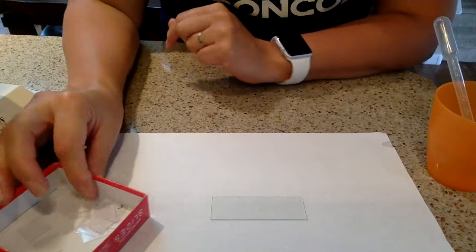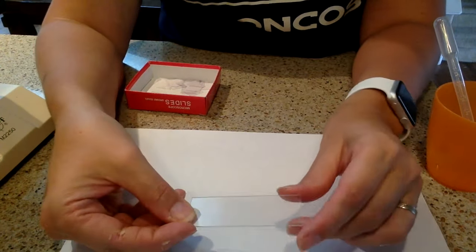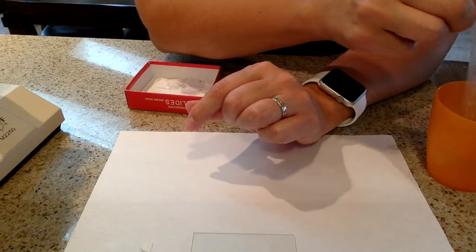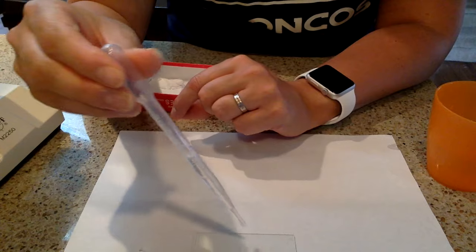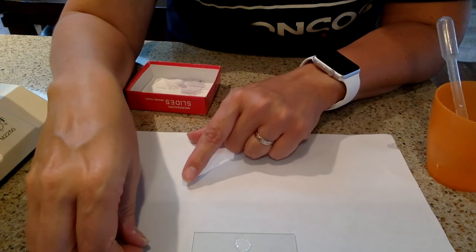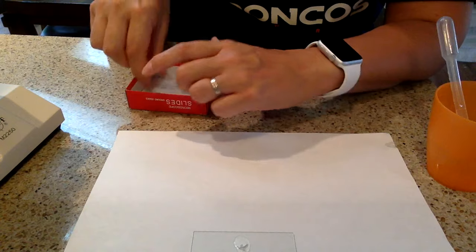So here I am going to show you how to make that wet mount slide. You are going to take your clean glass slide and place it on the table, or whatever your work surface is, and then you are going to put a drop of water on it. Sometimes you need two drops — just a good size drop — you don't want anything too large. Then you are going to place your specimen in the drop of water.